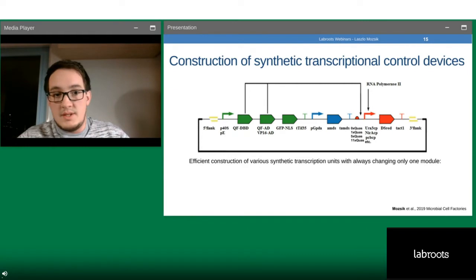A schematic map of the synthetic transcription factors is shown on the presentation. So we wanted to test numerous promoters to drive the synthetic transcription factor. So we were able to modularly just exchange these elements in the assembly line. Marked with green, you can see we tested 2 different promoters, as well as 2 different activator domains in the synthetic transcription factors. In the red, you can see that we tested numerous binding sequences for this synthetic transcription factor, 0, 1, 5, and 11 binding sequences, as well as numerous core promoters for Penicillium in front of the gene of interest for transcriptional regulation of the gene of interest. And using fluorescent reporters, this system was also easy to validate.